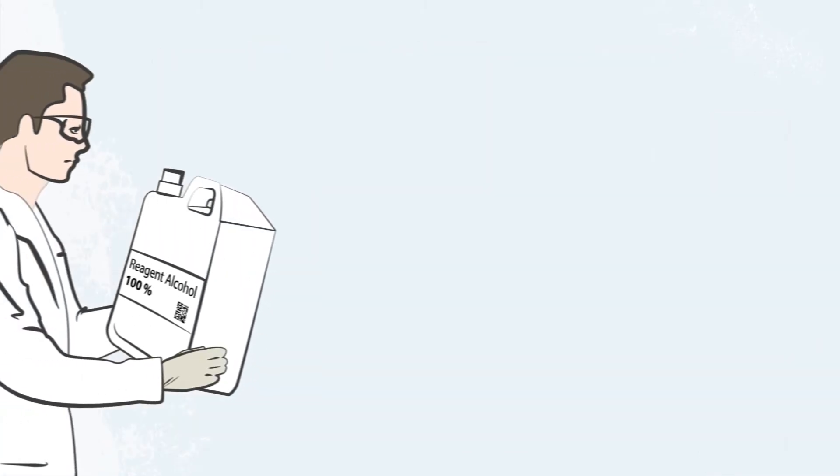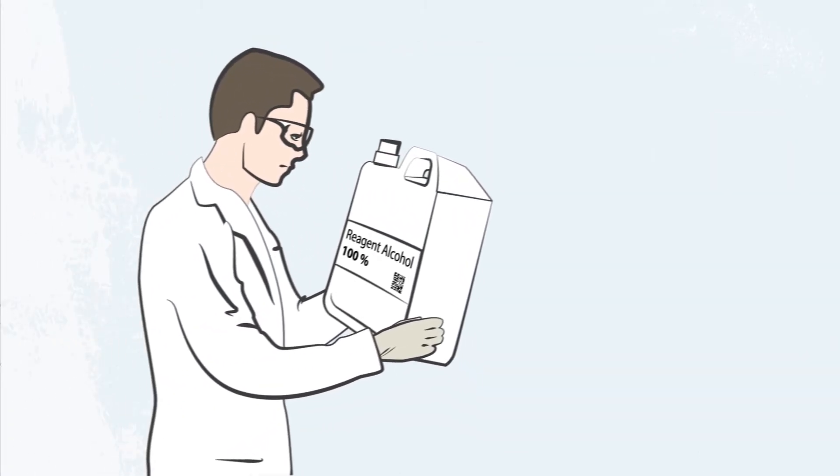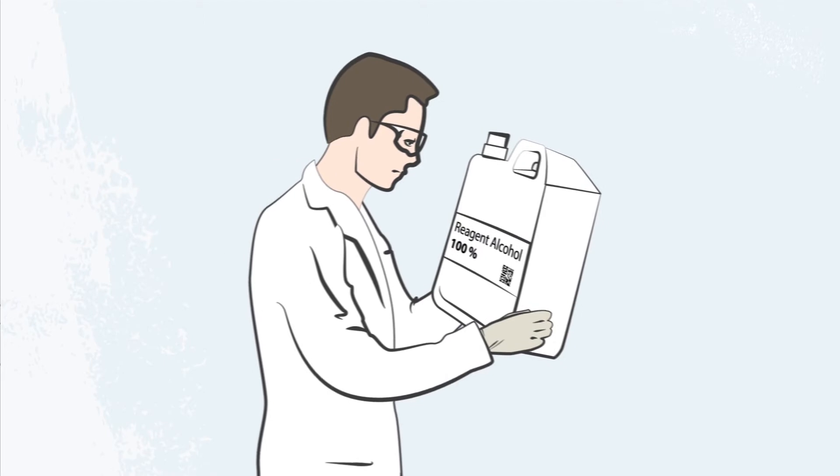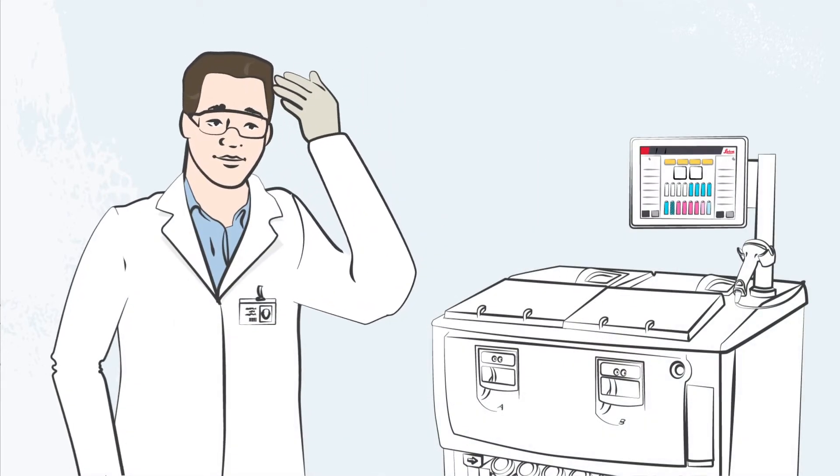Thanks to the new integrated density meter, Polaris 3 is able to safeguard the quality of the reagent and protect the integrity of the tissue.